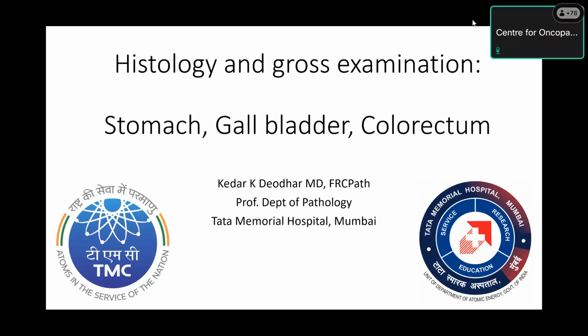So this is a talk on histology and gross examination of stomach, gallbladder, and colorectum. Because I was wondering with myself, which organs shall we start with grossing? And fortunately for me, the Whipple surgery grossing was coming out to be a longer slide presentation. But fortunately for all of us, next week we have Dr. Annie from Washington University, who will be covering pancreatic grossing. So I will confine myself to stomach, gallbladder, and colorectum.